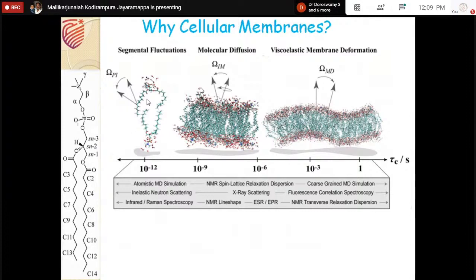One is what we have written, principal axis to intermediate frame. If I consider only two bonds here, motions can occur at that point also. These CH2 groups, wherever we are considering, should be attached to four substituents, right? Instead of one hydrogen, one carbon is attached.